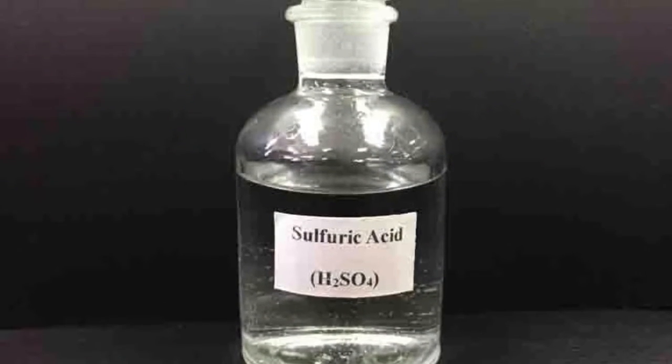Next, we prepared 25 milliliters of 9 molar sulfuric acid, and this acid was poured into the filtered solution. Note that the filtered solution is now AlOH4-, or aluminum hydroxide. So we poured the 9 molar sulfuric acid into that solution, and we noticed crystals forming after several minutes. This is solid aluminum hydroxide.